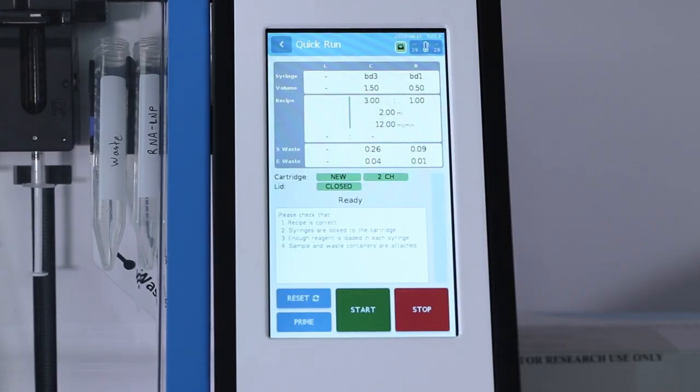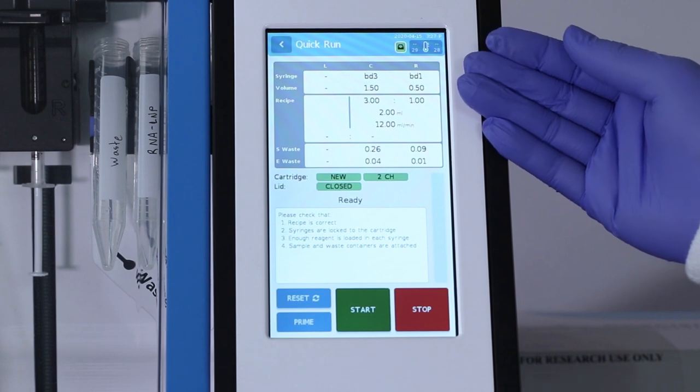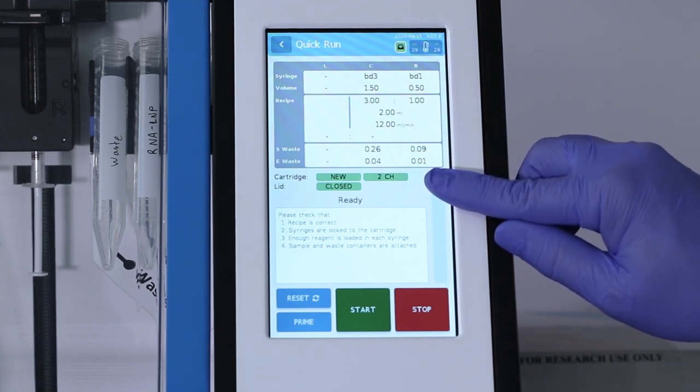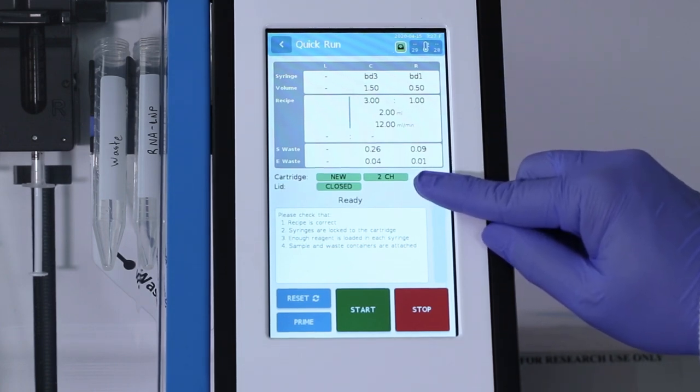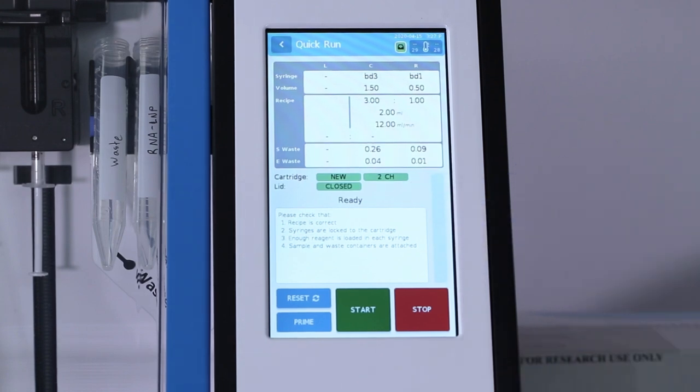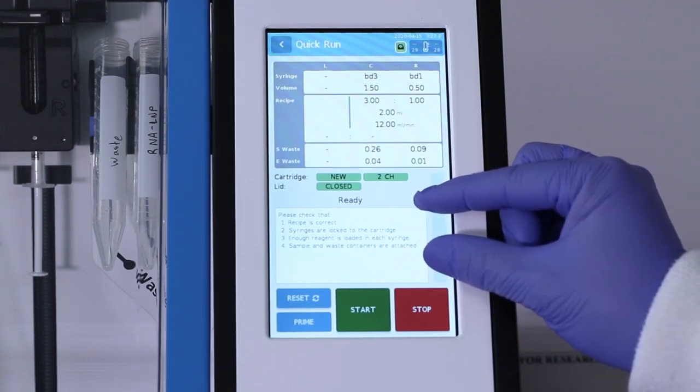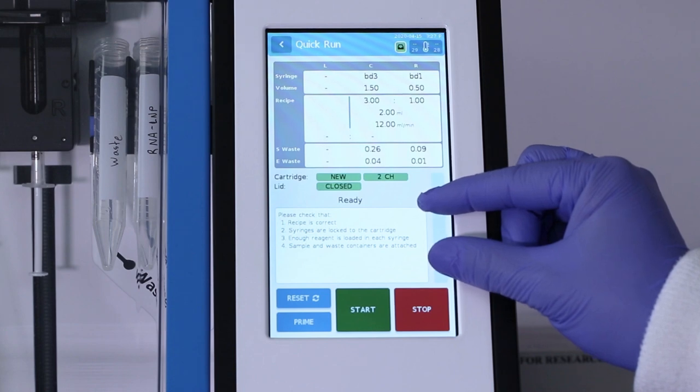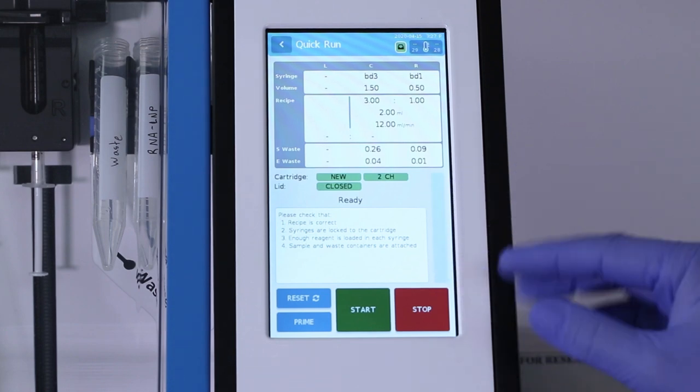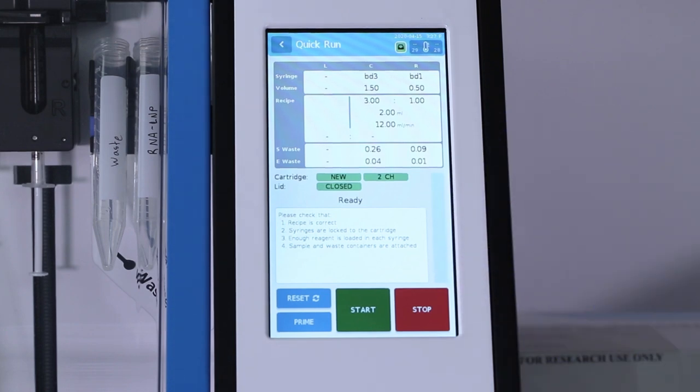Hit Next. And here you'll see a summary of your formulation. And an indication that your formulation is ready to go. You have a new cartridge. It's the correct type of cartridge. And your lid is closed. It'll also ask you to check that your recipe is correct. Your syringes are locked into the cartridge. You've loaded enough reagent. And we've done all of that. And so with that, I can just press Start.